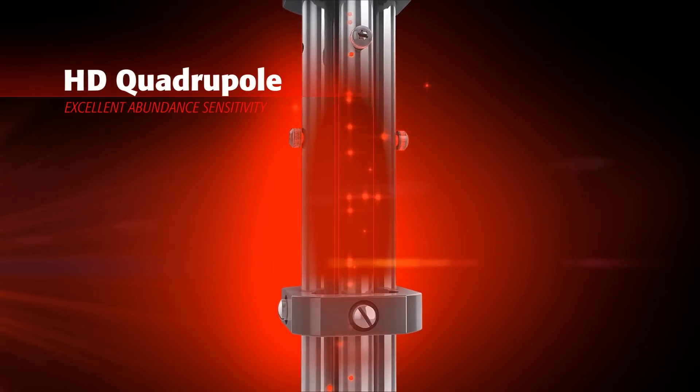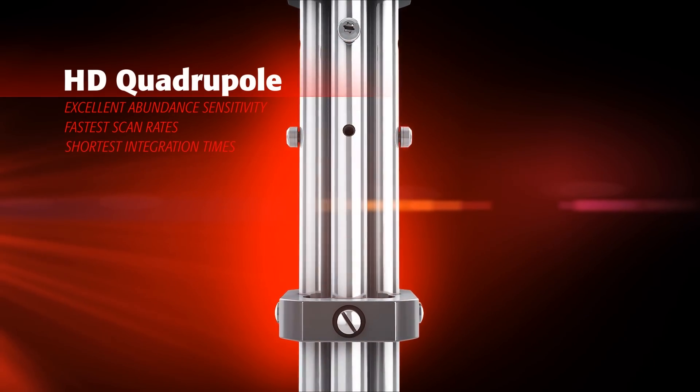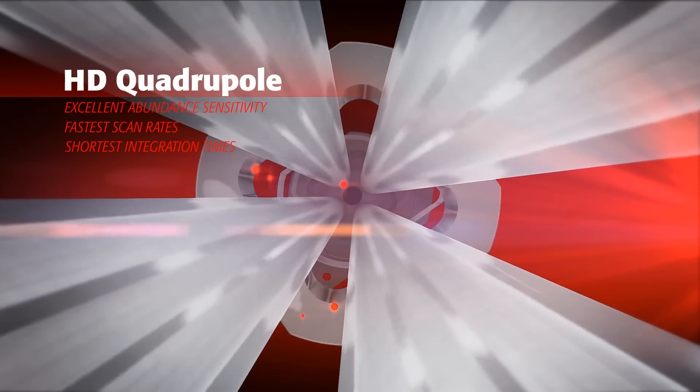The high-definition 3 MHz quadrupole delivers fast and efficient mass separation and excellent abundance sensitivity, providing superior isotopic analysis.